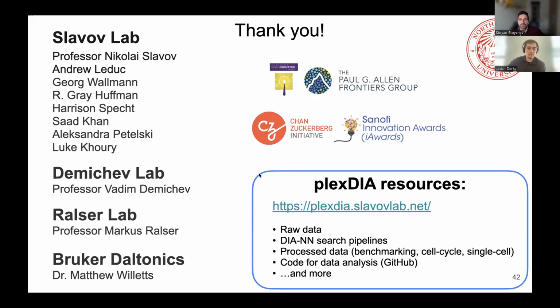But I think in the future with bulk, you could probably go up to 6-plex or potentially even higher. But especially for single cells, because you're not going to have as deep of coverage, you can easily, in my opinion, go to 10-plex or more.